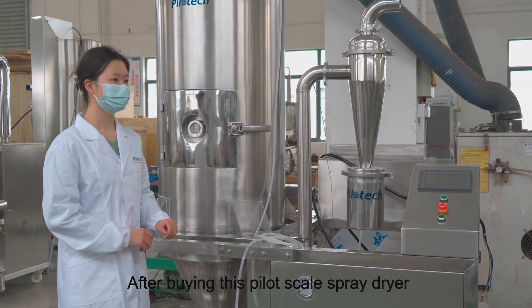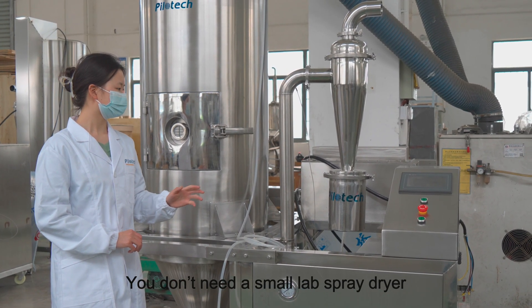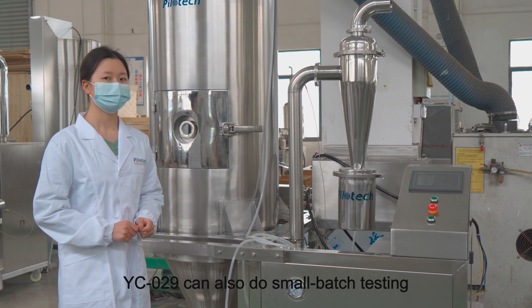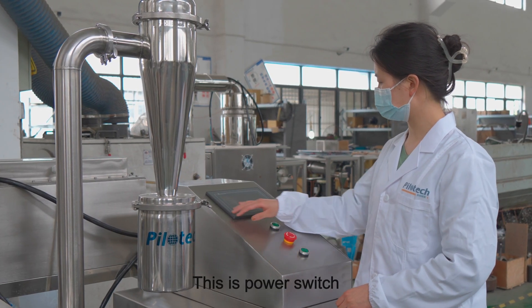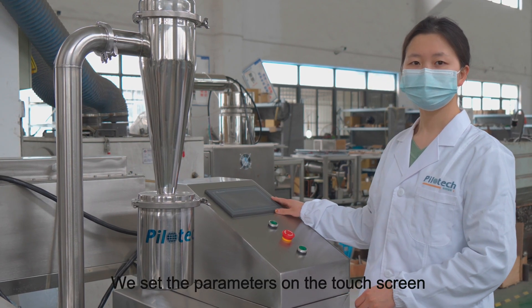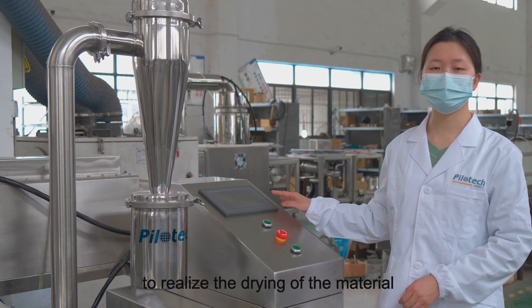After buying this pilot scale spray dryer, you don't need a small lab spray dryer. YC029 can also do small batch testing. This is the power switch, and this is the touch screen. We set the parameters on the touch screen to realize the drying of the material.